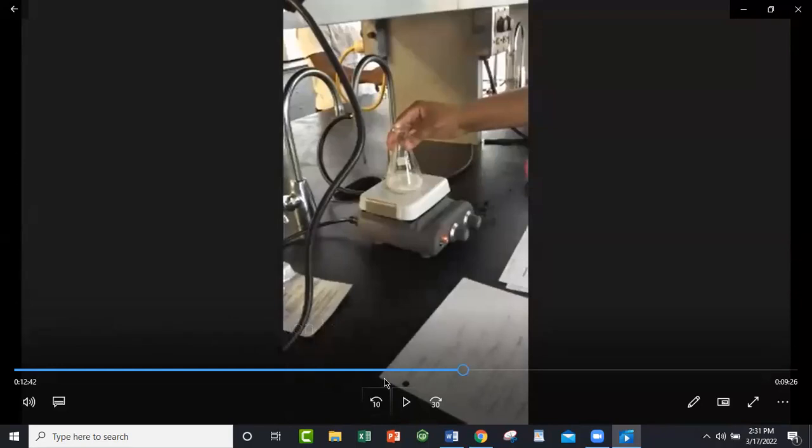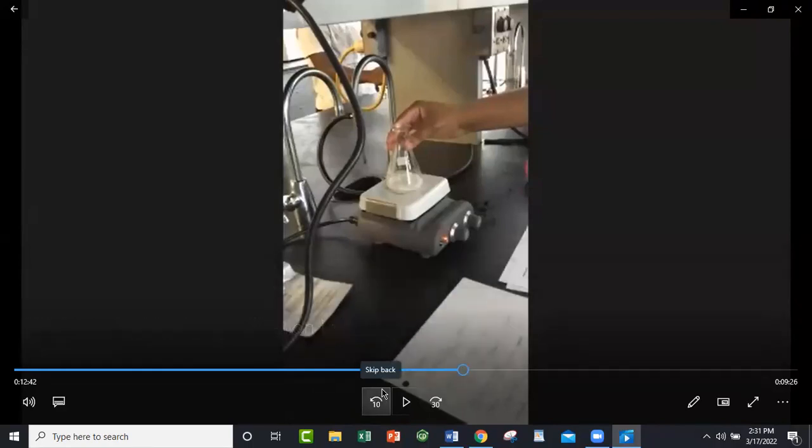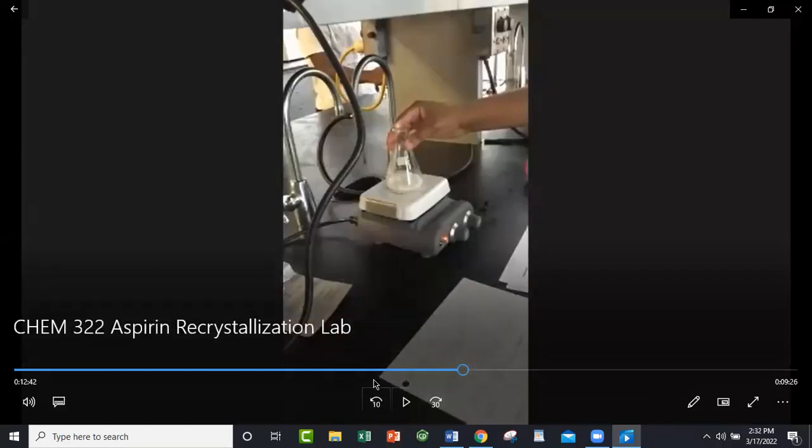Don't let all the solvent boil off, because the purpose of the recrystallization is to purify aspirin, to get rid of all the other stuff, the leftover salicylic acid and the leftover acetic anhydride and leftover acetic acid, which is a side product. So if you don't heat this properly, or if the crystals form too fast, it's going to be impure. Stay hot. If it's not hot, then it's not going to dissolve.